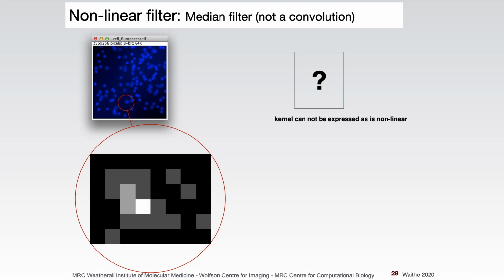So now, if I haven't lost you completely, I'll talk about some nonlinear filters. These are also useful, but they can't be represented with a nice kernel because they do a different thing depending on what they see in each location of the image. And this is the difference. With convolution, we can define it as a nice kernel, but with nonlinear filters, we have an algorithm. We can have a set number of steps, which is reproducible, but you can't represent it easily as just an image of numbers like we did previously.